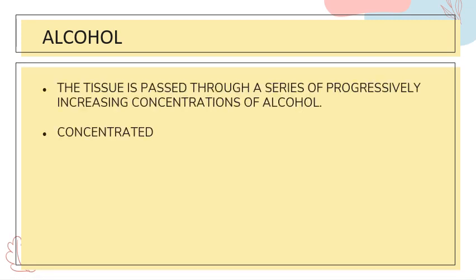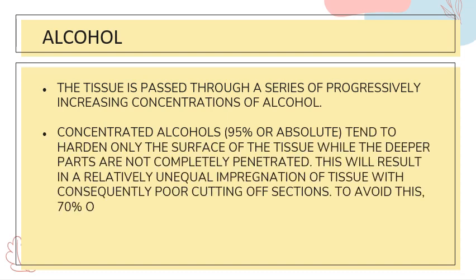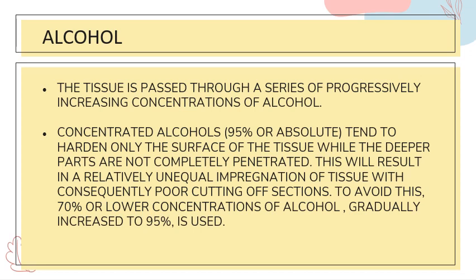So the tissue is passed through a series of progressively increasing concentrations of alcohol. Concentrated alcohols, 95% or absolute, will tend to harden only the surface of the tissue, while the deeper parts are not completely penetrated. This will result in a relatively unequal impregnation of tissue, with consequently poor cutting of sections. To avoid this, start with 70% or lower concentrations of alcohol, and then gradually increase it up to 95%.